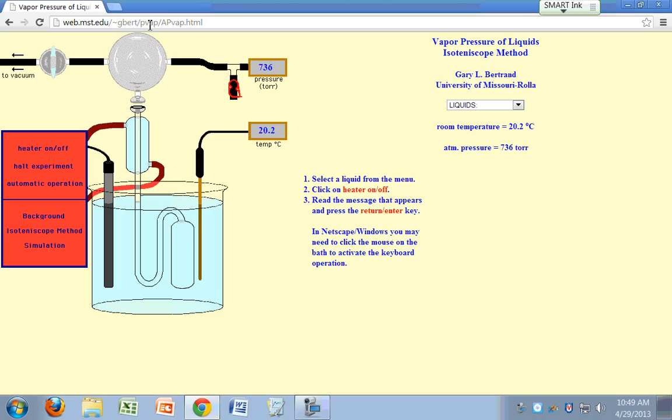This is a simulation of the isotenoscope method for measuring the vapor pressure of liquids. This thing right here is your isotenoscope.